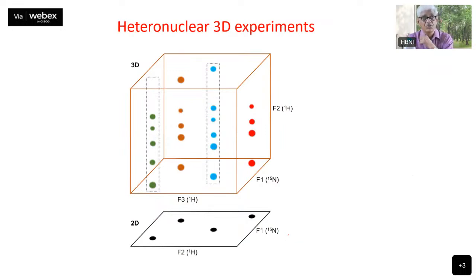So if you have these two, then you establish correlation from each of these protons, each of these peaks here, into another set of peaks which are along the F2 axis. F1, these same four peaks are present here and here. These peaks are the same. So now what you have done is extend this information along another proton axis. This extension can be due to what? It can be due to the TOCSY. So from this particular proton, you may have a TOCSY relay to other protons along this axis here.